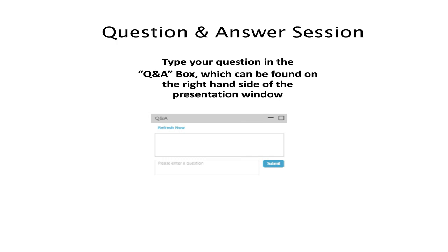This is a similar question. What's the smallest spatial resolution for the Spotlight microscope? It looked like something like 5-micron pixel width, but can it go smaller? So the spatial resolution of the system, any of the Spotlight microscopes, is a function of sampling technique as well as the hardware itself. And so the lower limit is somewhere in the neighborhood of 2 to 3 microns, but again, it is also actually a function of wavelength.